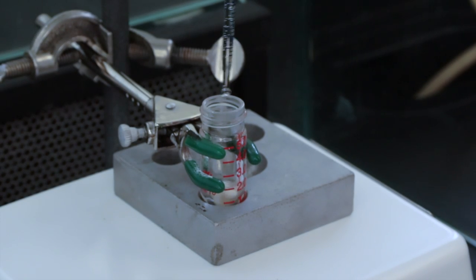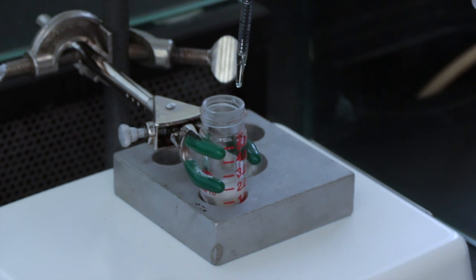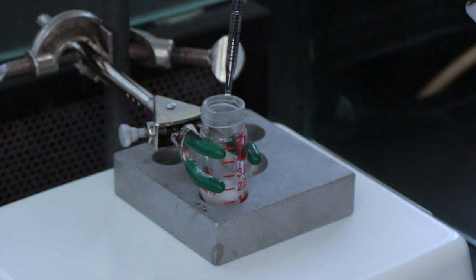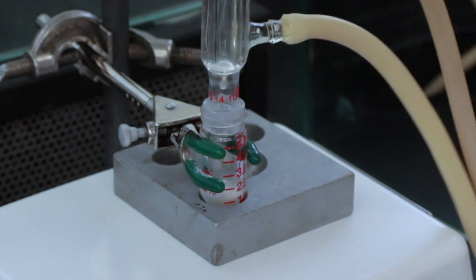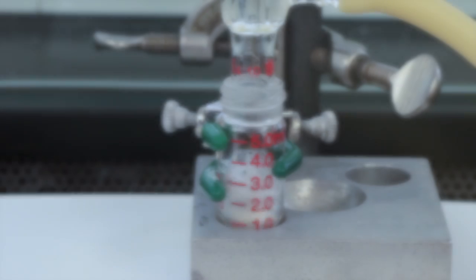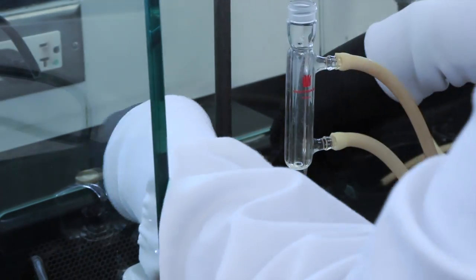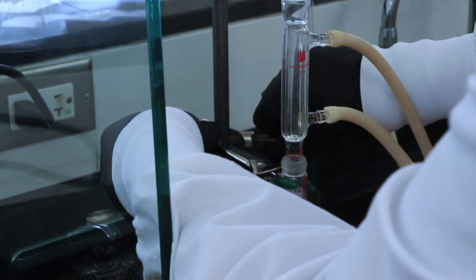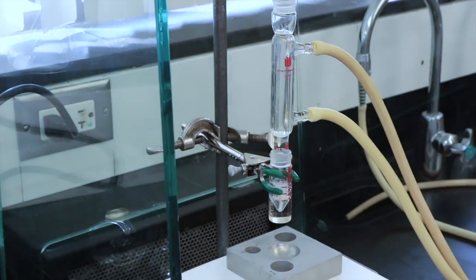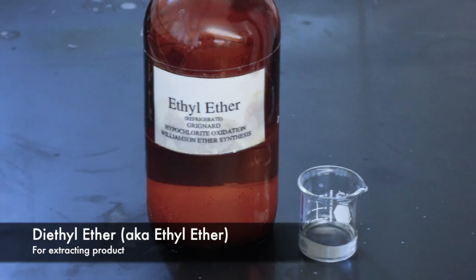This is also very reactive, so I'll be adding the hydrogen peroxide dropwise over a period of about 10 minutes. And we'll let that reflux for an hour now. Once the reaction is completed, I'll take it off the heat so everything can cool down for our extractions, and we'll be using ethyl ether for said extractions.